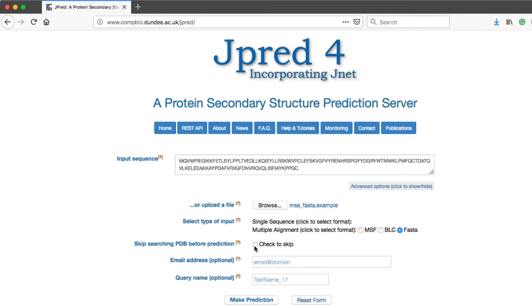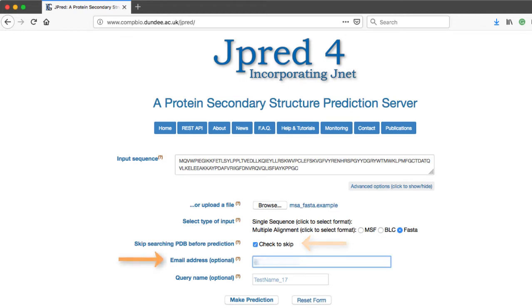The PDB search can be skipped by checking the box. If an email address is entered, an email is sent when the prediction is complete. The email will contain a link to the results along with a brief summary of the results. This step is optional.